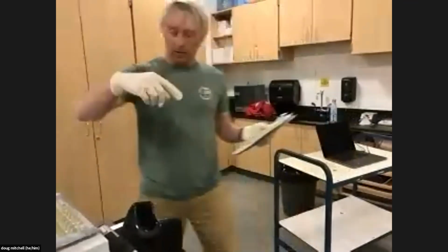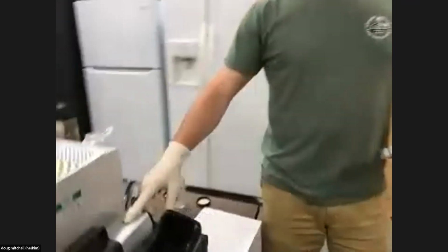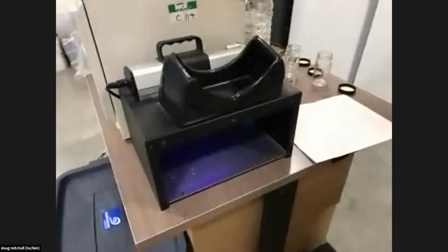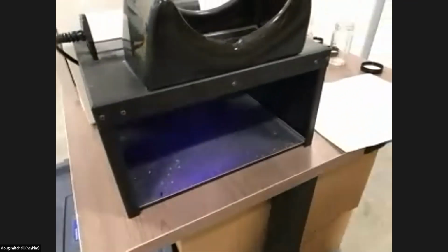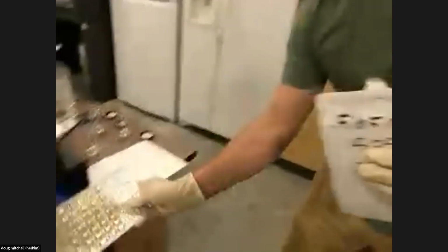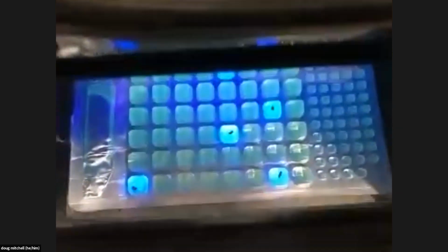If you want to come over here, Reba, this is a UV light, and it shines down below. When there's bacteria in the samples, they'll fluoresce in these trays. So you can see, this looks like it's fluorescing, but that actually is a clean sample. This is the Tolomon outfall reading. So it has some bacteria. I'll show you how we can evaluate exactly how much.